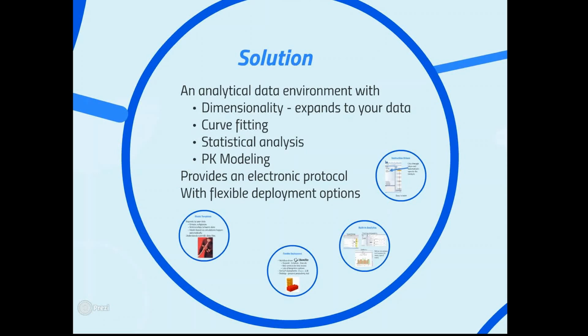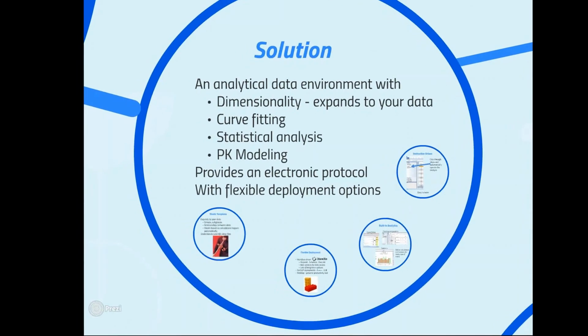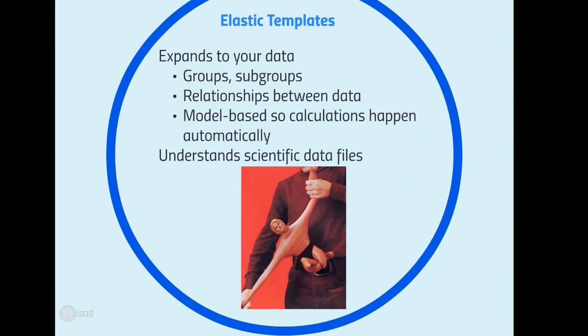So it comes with inbuilt curve fitting engine, graphing and charting, statistical analysis, and also non-compartmental modeling for PK. The system provides an electronic protocol which helps to guide the user of the system through how to operate the analysis and the experiment. The same analytics solution is provided into a number of different flexible deployment environments, which I'll outline. So let's talk about the first aspect here, which is the elasticity of these templates.